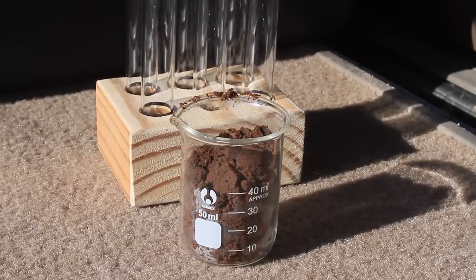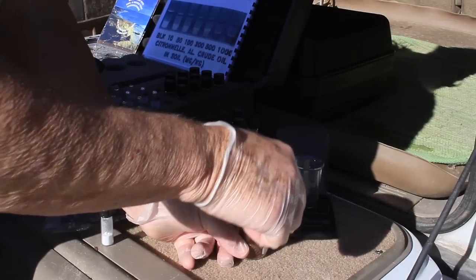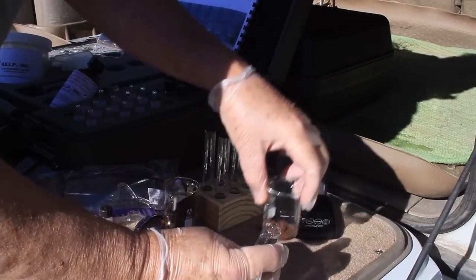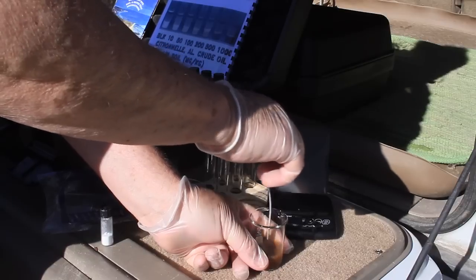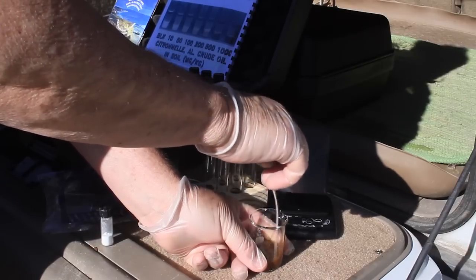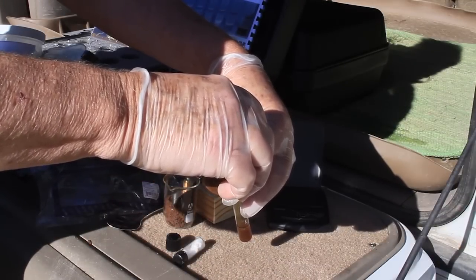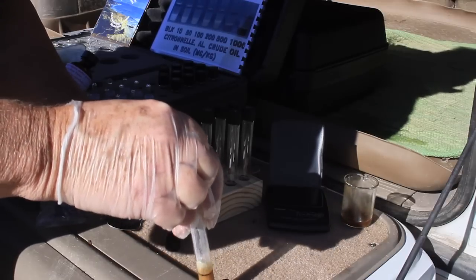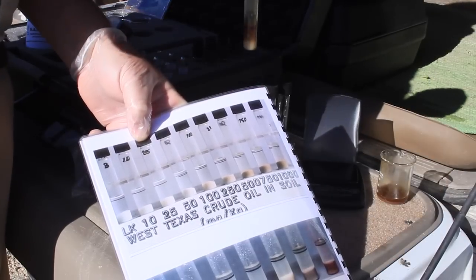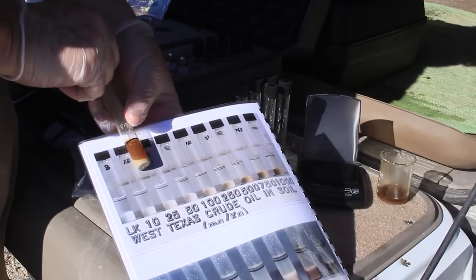For the soil sample, place one of the 50 milliliter beakers onto the balance and turn it on. Weigh five grams of the soil sample into the beaker. Snap the top and empty the solvent ampule into the beaker. Use the spatula to break up and stir the soil in the beaker for one minute. Next, pour from the beaker up to the line on a sample test tube. Then empty a catalyst powder vial into the test tube and shake for one minute. Finally, compare the catalyst color to the appropriate gasoline, diesel, or solvent calibration photo.